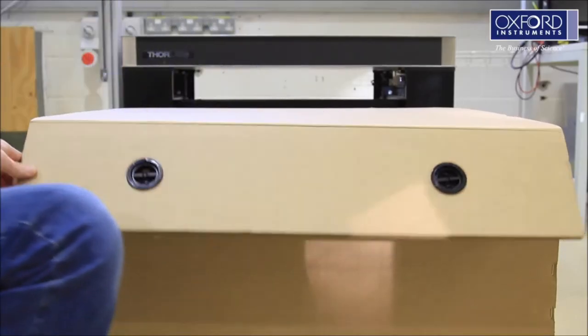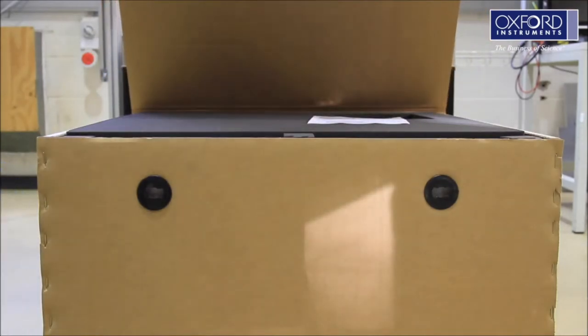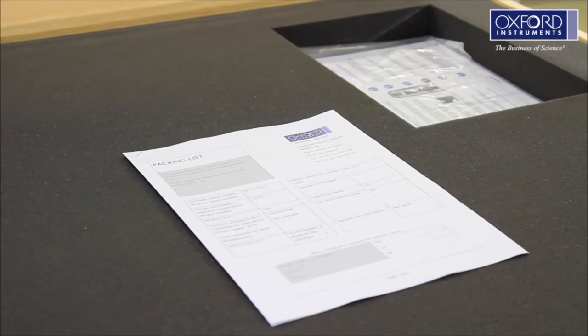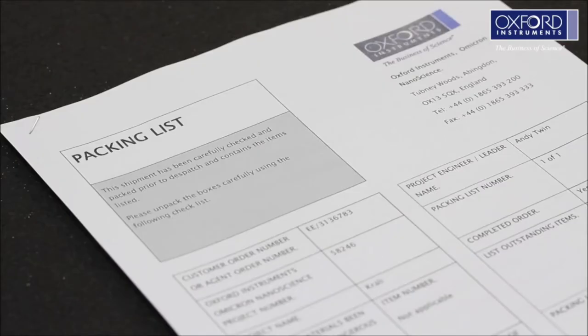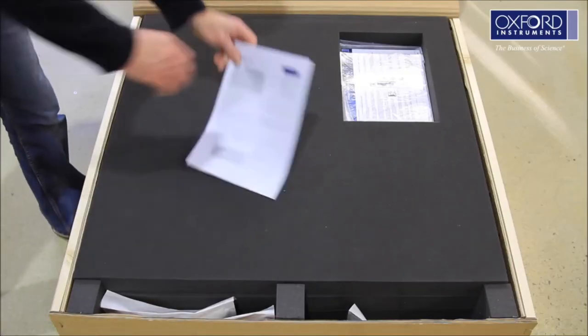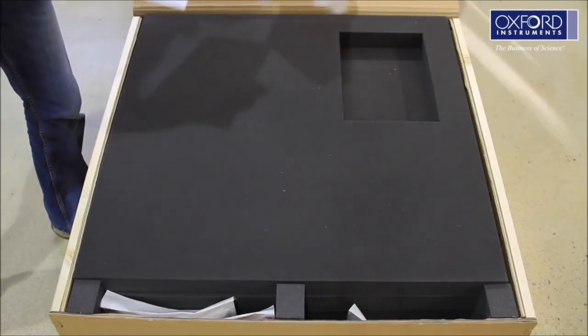In the top of Box 1 you will find your packing list. Check all items against this list. If there are any discrepancies, please let us know. Also in the top of Box 1 you will find the system manual and other safety material. Most of this information is on a CD. You must read these documents fully and understand all the health and safety information before you proceed.